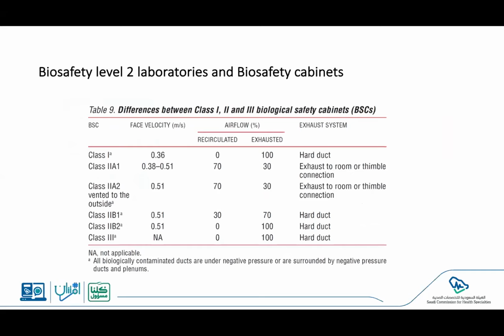And the reason is, if you go through the different rows in this table, you will realize that at biosafety level 2, A1 and A2 have a little bit of difference in the face velocity, but what's in common is that 70% of the air is recirculated within the biosafety hood, and 30% is exhausted inside the laboratory. However, it's through a HEPA filter, which means it's particle free. It should have no virus particle whatsoever, as well as any other particles.